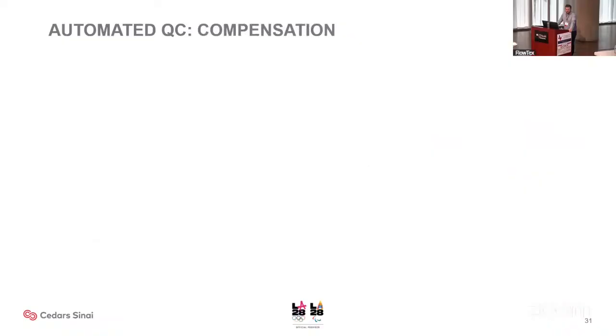So I think this really stems a big debate. Do we do compensation, which is kind of what the Cytek method is, versus do we adjust the unmixing matrix? Both of the platforms allow for adjusting of the unmixing, whether that be more of a traditional compensation method or adjusting the unmixing. And this can be a pretty unwieldy task and take a lot of training and a lot of time if you're doing it on every sample.